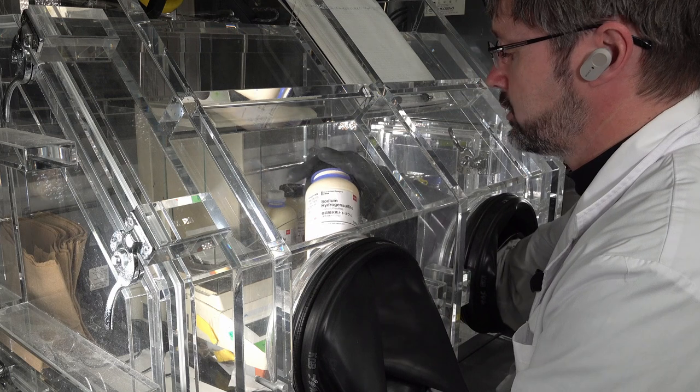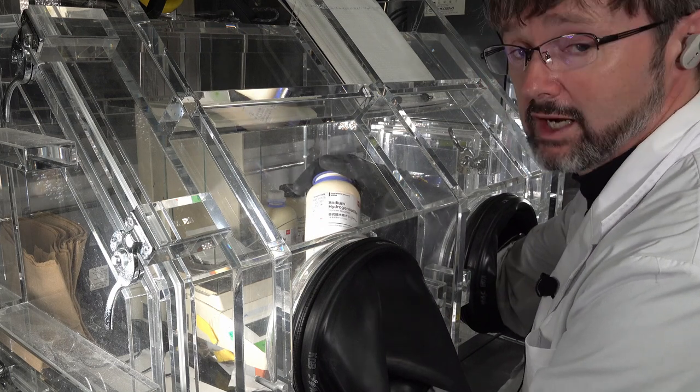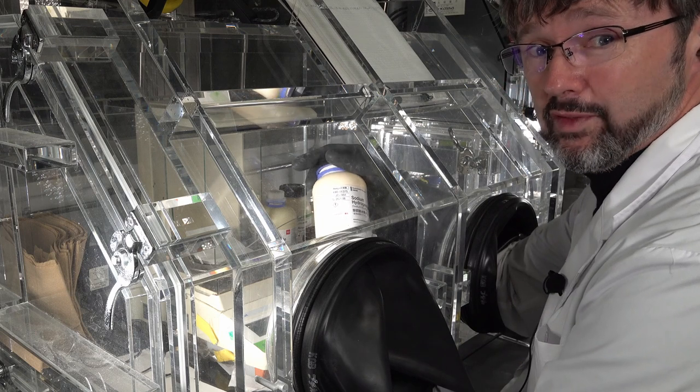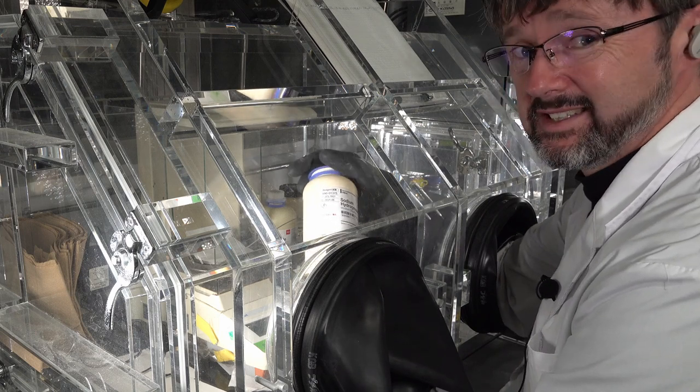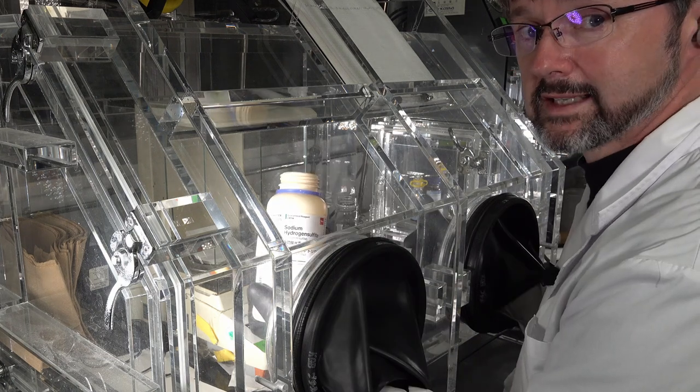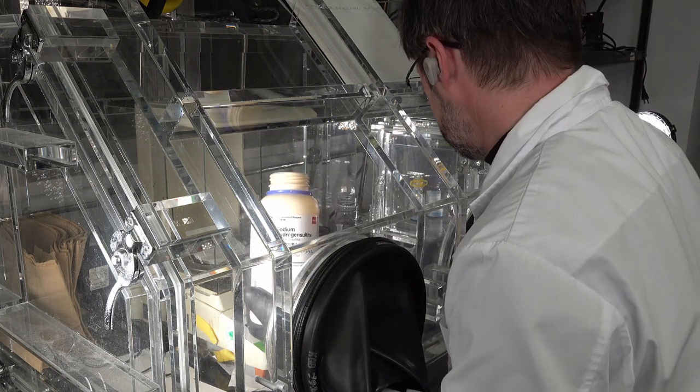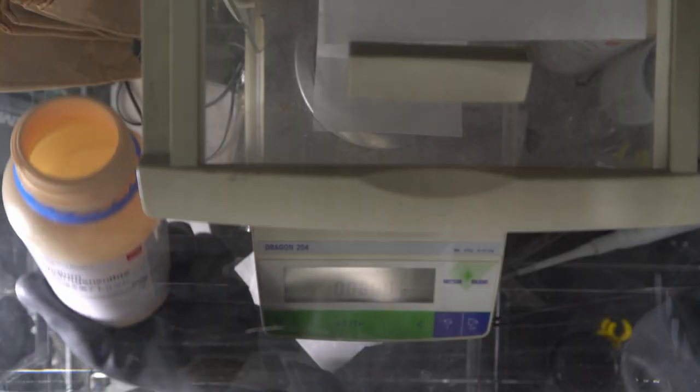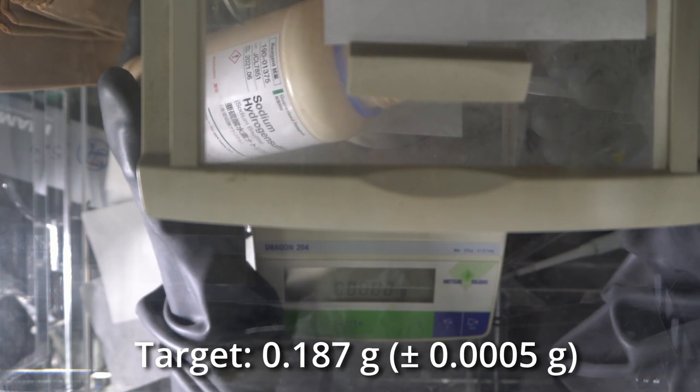I'm gonna weigh out the sodium sulfite - sorry, the sodium hydrogen sulfite first - because it's the easiest one. There's more of it, which makes it easier to weigh out. 0.187 grams. That's my three significant figures there.